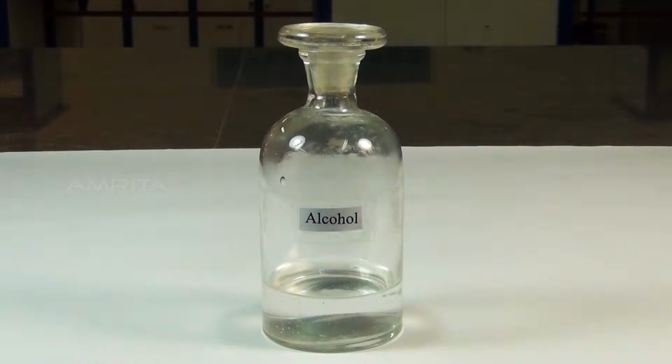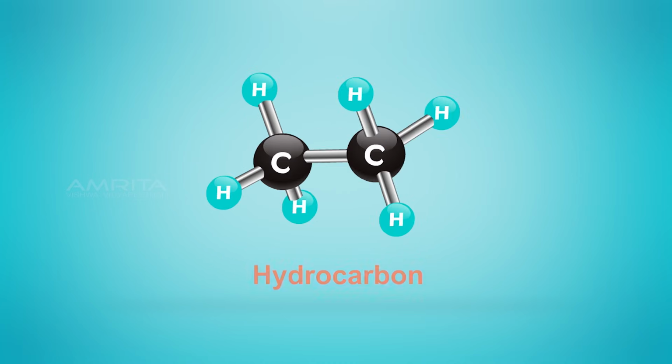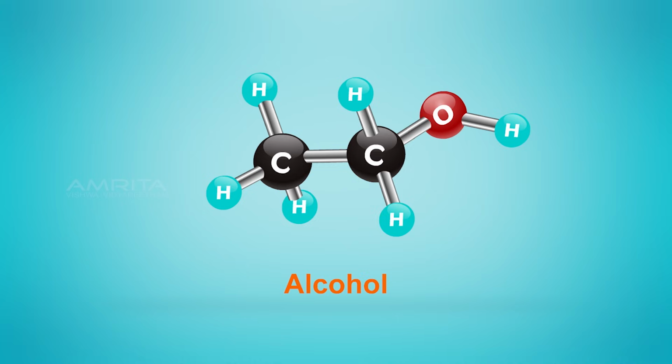Tests for alcohols. Alcohols are organic compounds containing the hydroxyl functional group. They are formed by replacing the hydrogen atom of a hydrocarbon with an OH group.